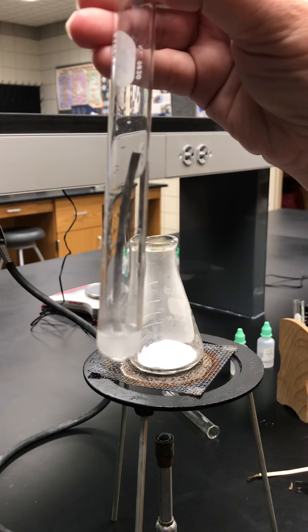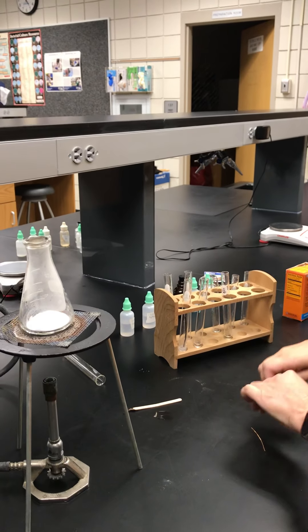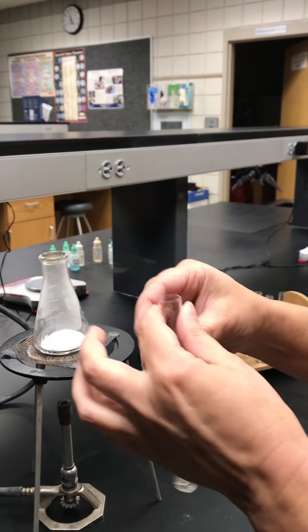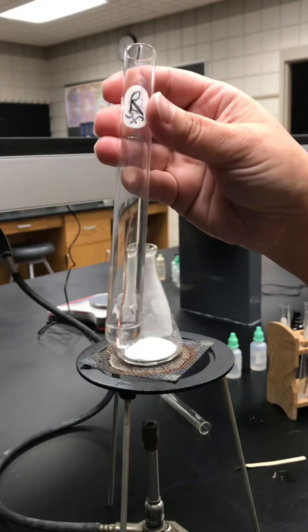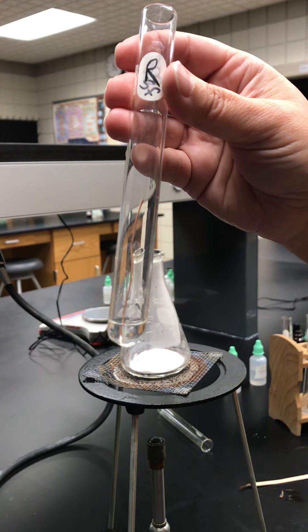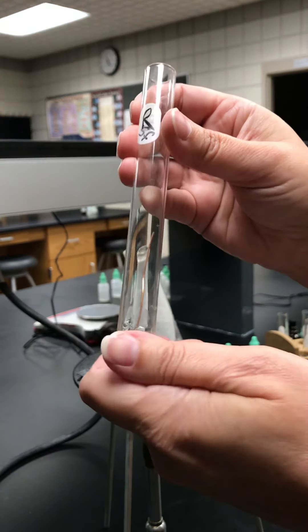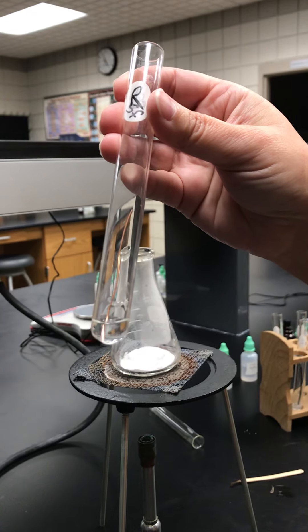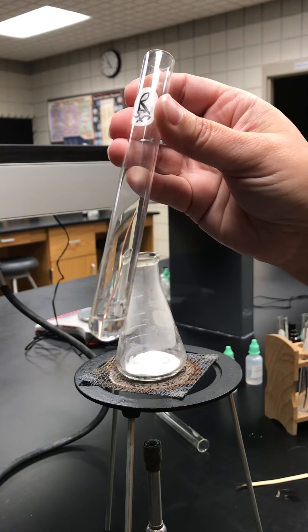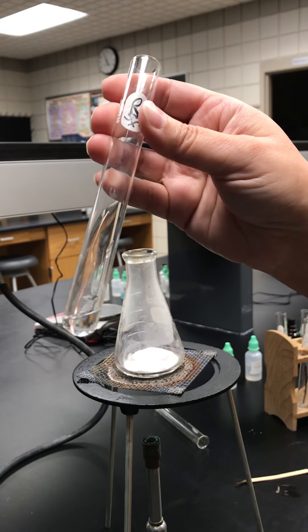That was the magnesium ribbon — we'll just let that keep going. I'm going to do the same thing: I have hydrochloric acid but now I'm going to put a piece of copper wire in here. Looking at that, I don't see any bubbles and I don't feel any difference in temperature, so we're going to say nothing happens. I don't see any evidence of a chemical reaction.